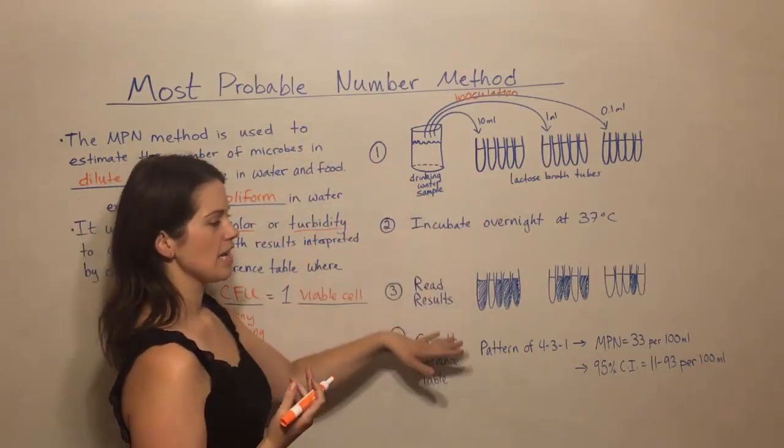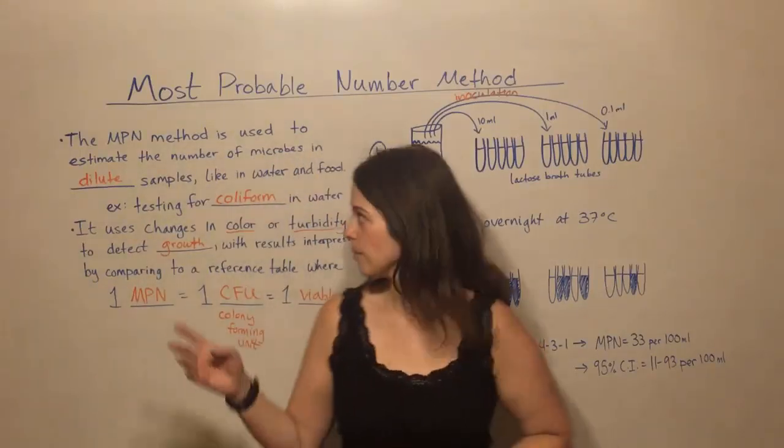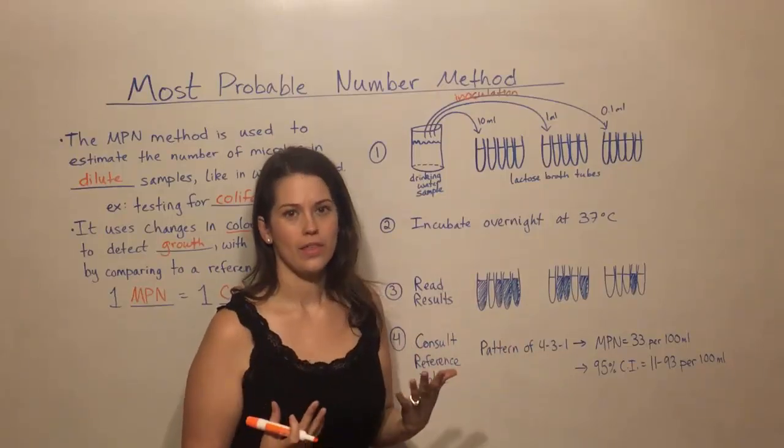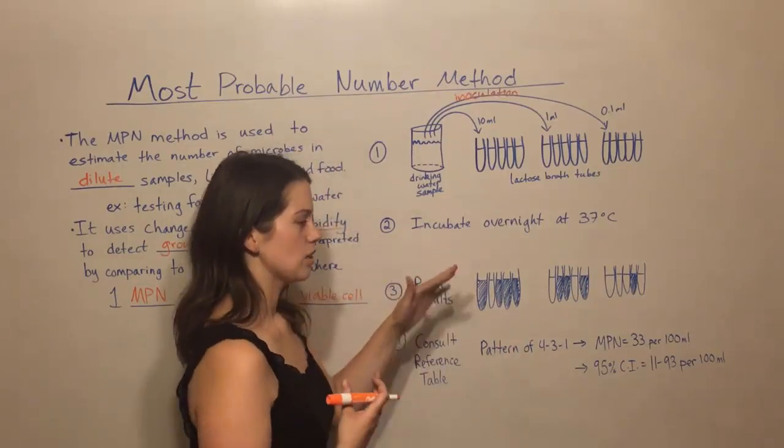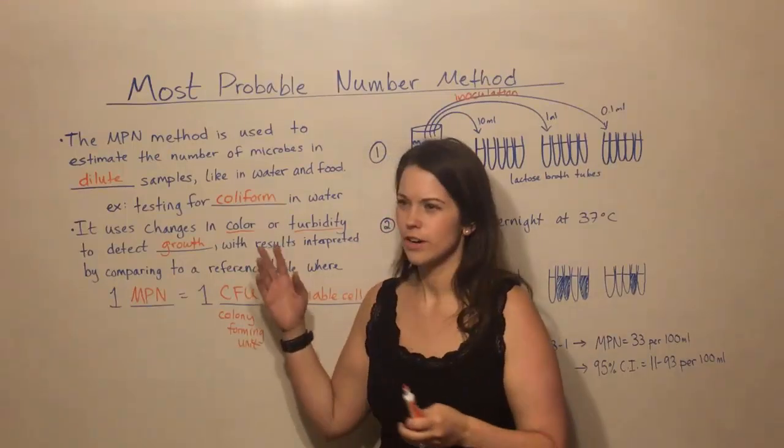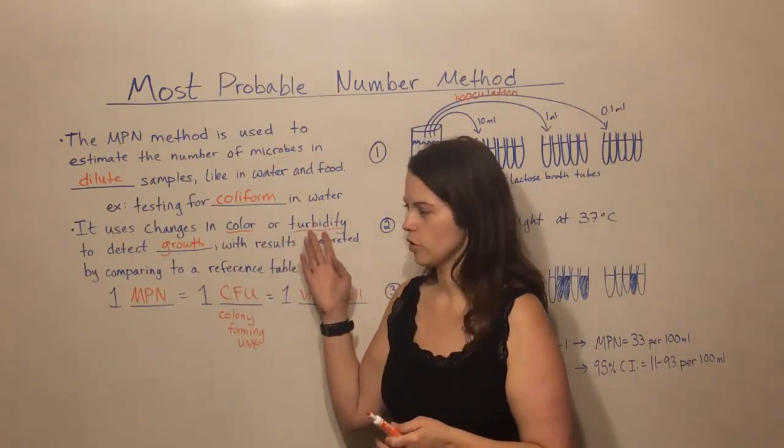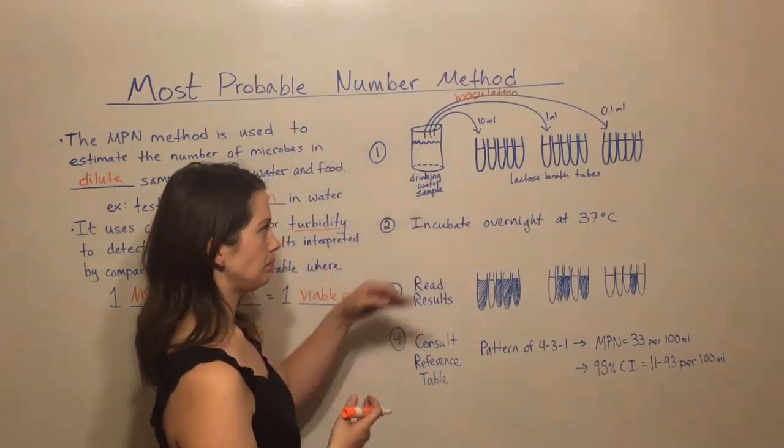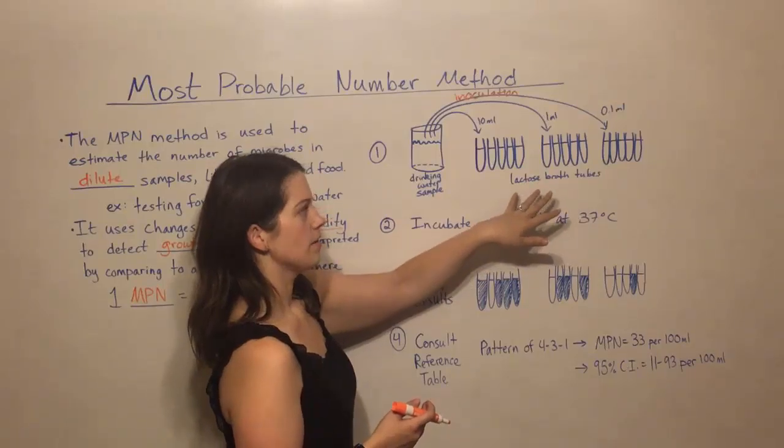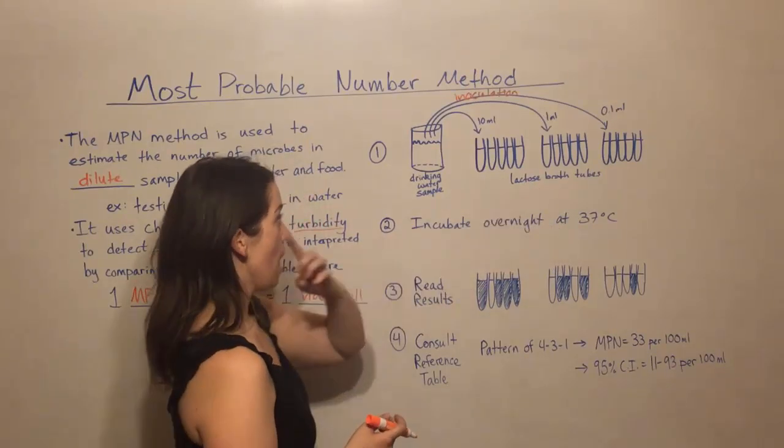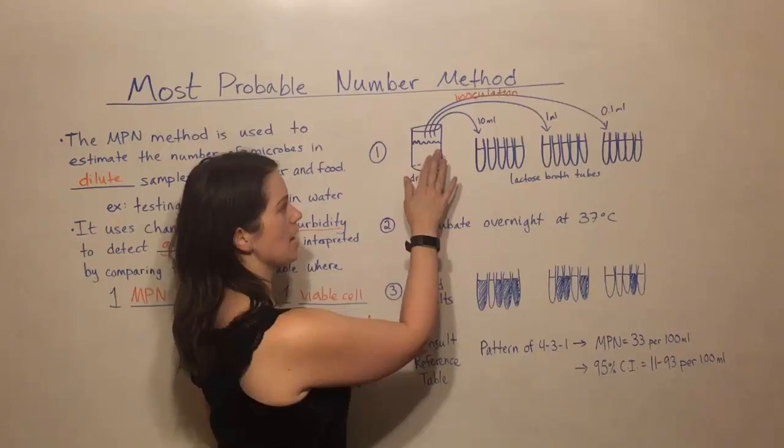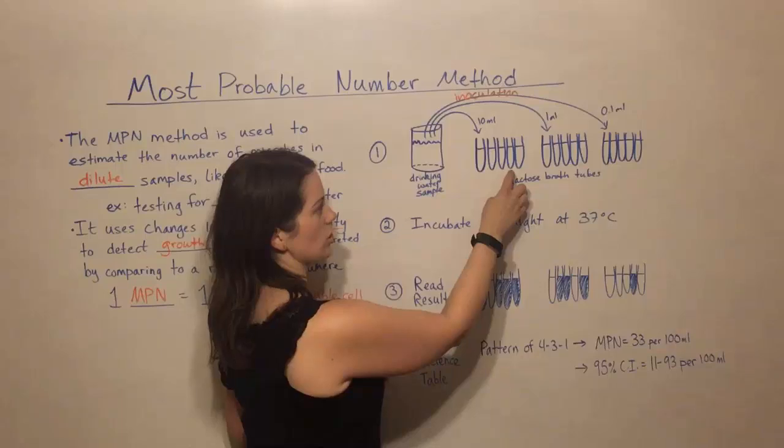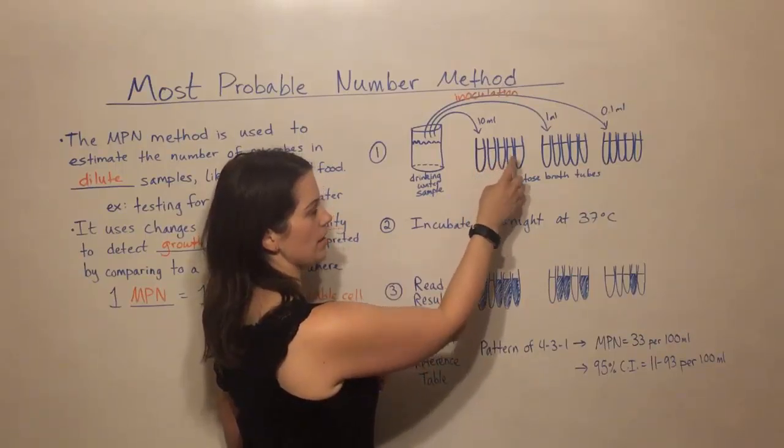And then we have three sets of five lactose broth tubes. Remember that in this example, we're looking for coliform bacteria and coliform bacteria can ferment lactose. You could do this method with other kinds of tests where you're looking for a different kind of color change or a different growth in turbidity and different kinds of broth, depending on the type of bacteria you're looking at. So here we have our three sets of five lactose broth tubes. What we do is we take 10 milliliters from the drinking water sample and inoculate each of these five tubes. So 10 milliliters added to each one.